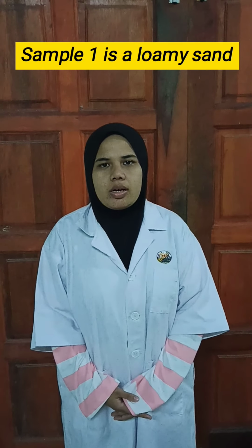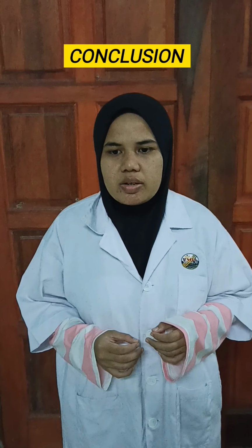Okay, so the result for experiment 2 is sample 1 is a loamy sand and sample 2 is a sand. So in conclusion, the objective for this experiment was achieved, as to familiarize oneself with the field method determination of soil textural class based on the characteristic of soil mineral materials, sand, silt and clay. And the second one, the soil textural class of soil sample using the field method, was qualitatively determined.